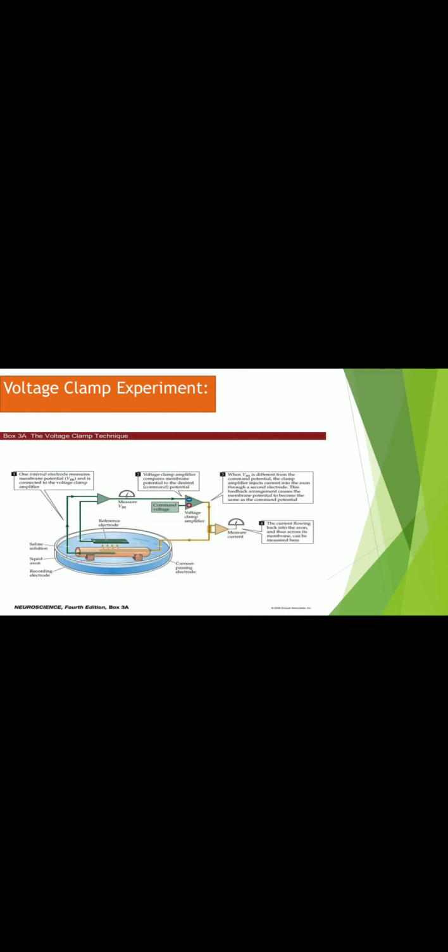desired level. The basic voltage clamp measures the membrane voltage, then changes the voltage to a desired value by adding the necessary current. By clamping the cell membrane at a required constant voltage, the voltage clamp can record what current we delivered. Whatever current we are delivering, the voltage clamp is measuring that current, because the current applied to the cell must be the current going across the membrane at a set voltage. The recorded current indicates how the cell reacts to the change in membrane potential.